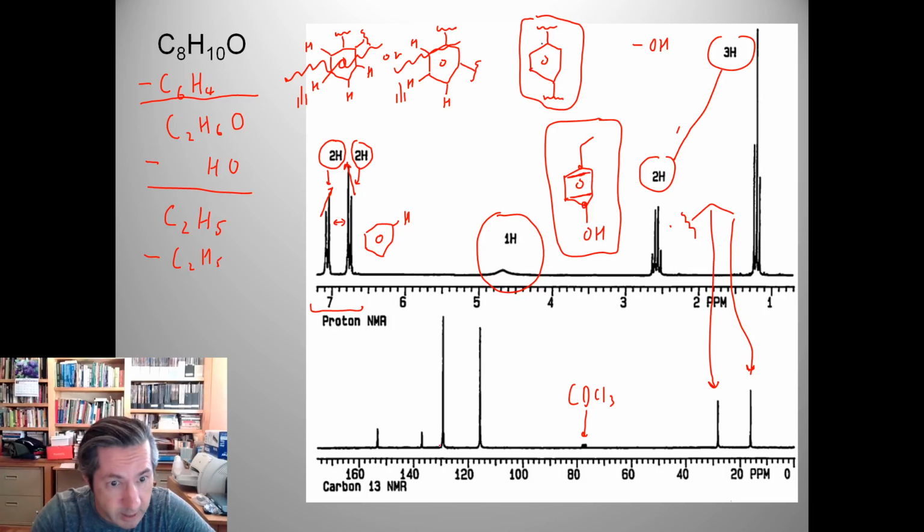Remember, there's a plane of symmetry running through this compound. So this type of carbon is the same as this one. And I'll put little squares around here. Those two guys are the same. And so we've got 2 big carbons, 2 small ones. The 2 small ones have to be the quaternary carbons, the ones that actually have no hydrogens attached to them.